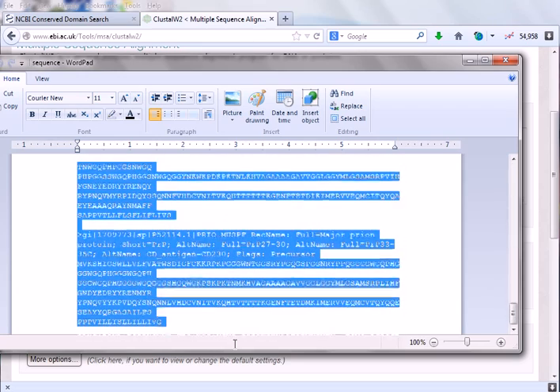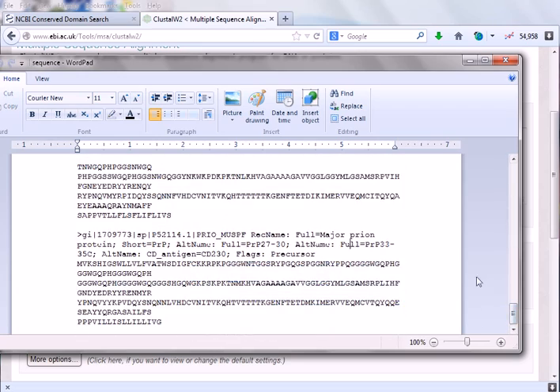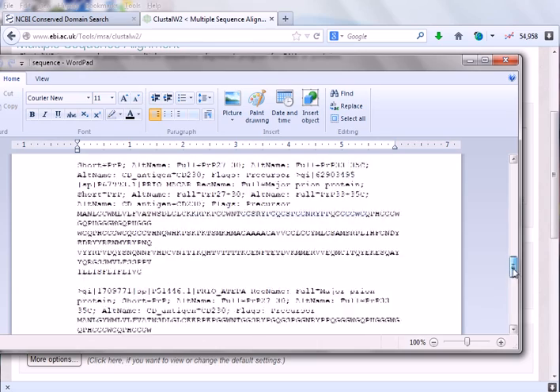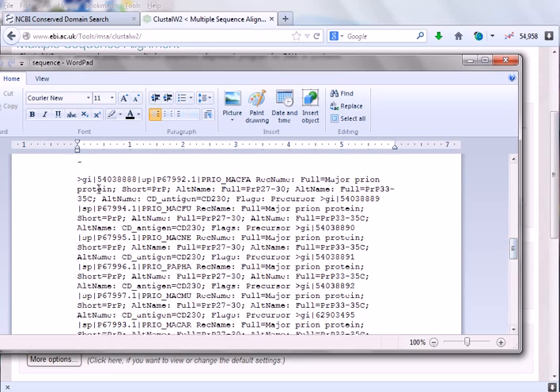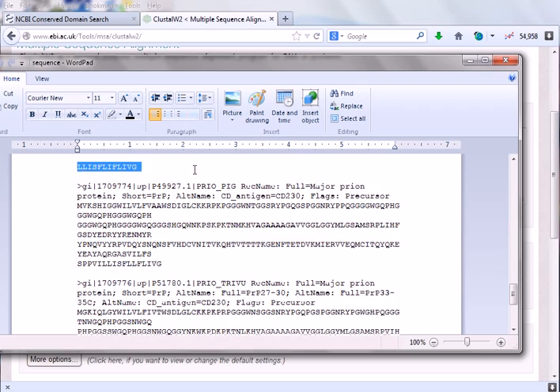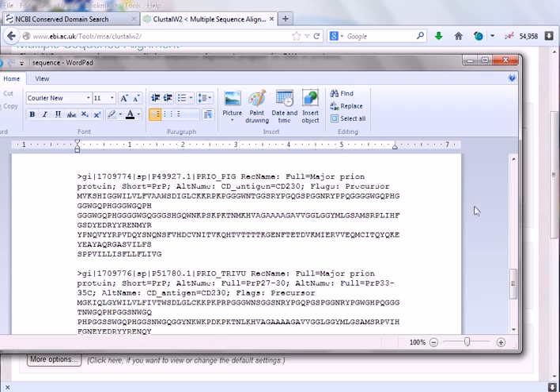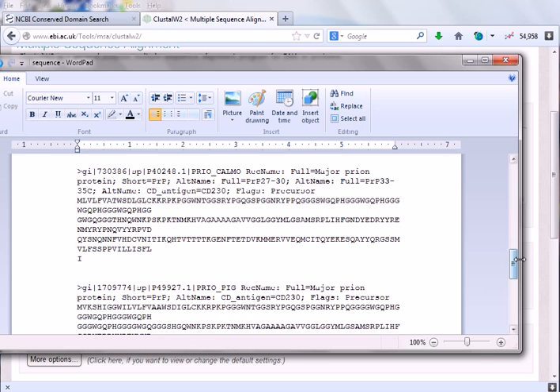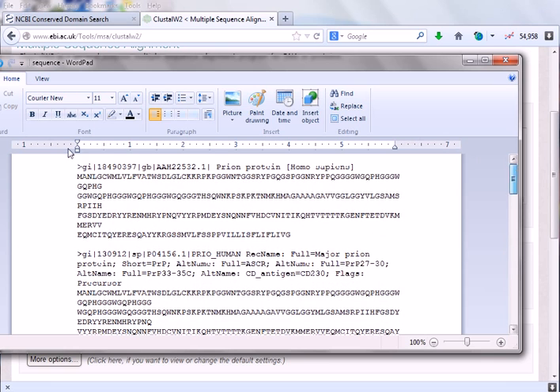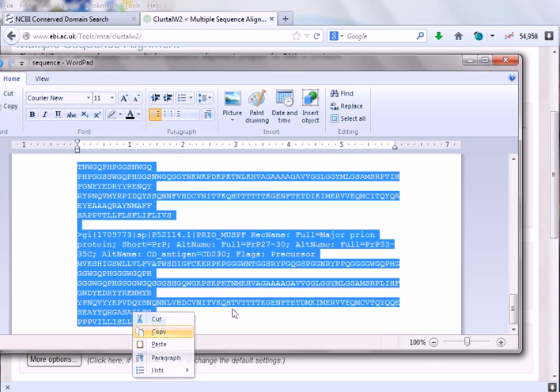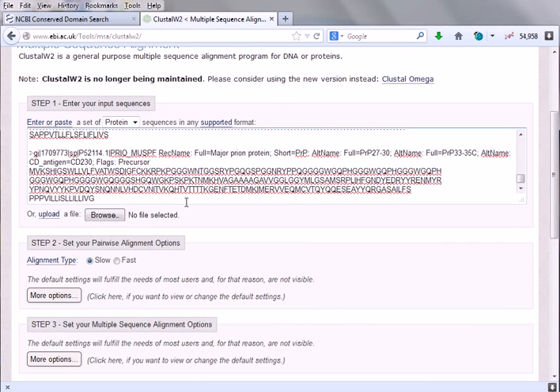It is the 10 sequences of ours, so we'll be selecting all the sequences. One exception is this sequence, because this sequence is with many other sequences. So except for this sequence, we'll be having rest of the sequences in our hand. Here are the sequences. We'll be copying all the sequences, copy, and then we paste this sequence here.